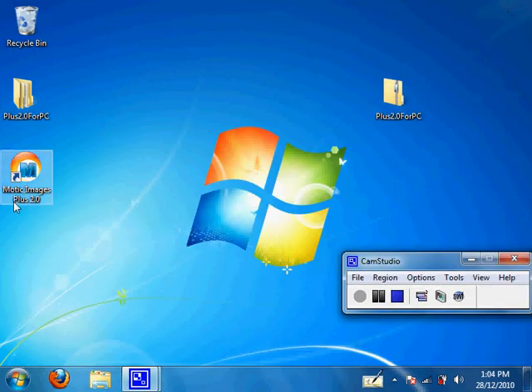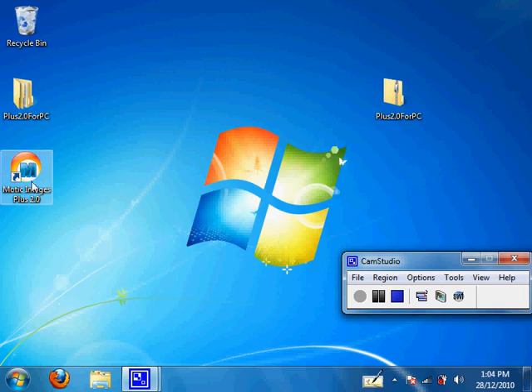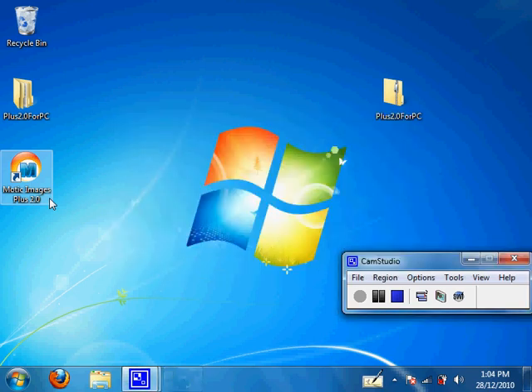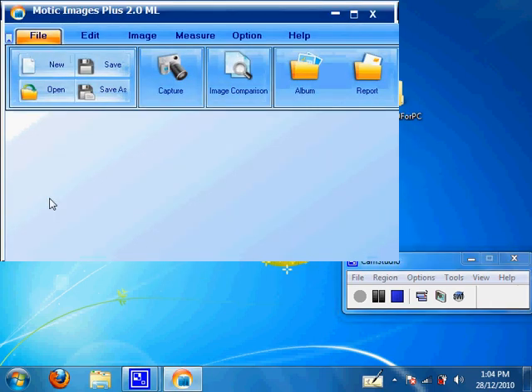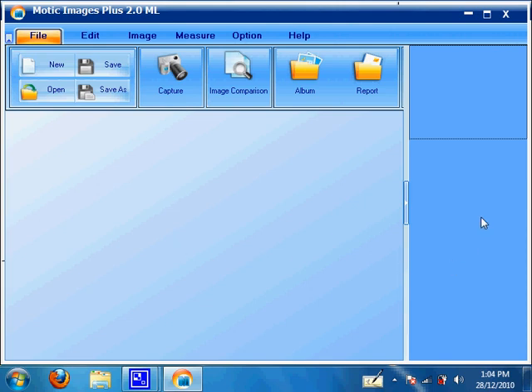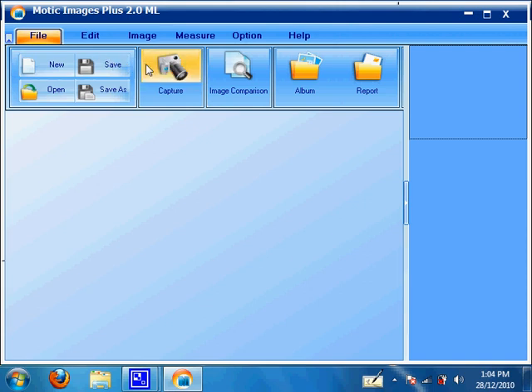Now, to test out your camera, please open up Motec Images Plus, the software you installed already, most likely. Once you open up Motec Images Plus, you may get a grey background interface or a blue background interface in my case. What you need to do is click on Capture for the blue interface. For the grey interface, click on File and then Capture Window.